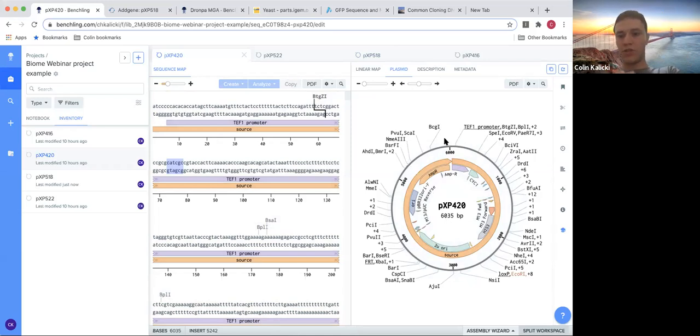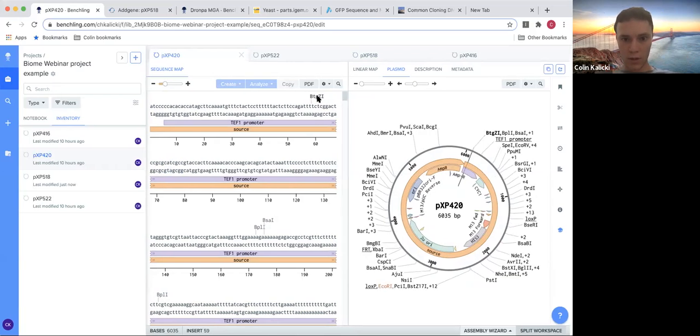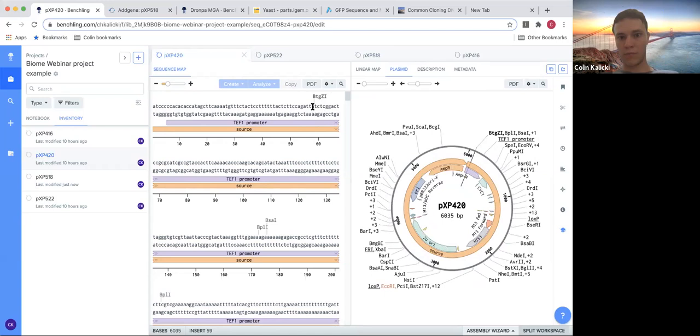So you're going to have these restriction enzymes. And if we zoom in really closely, or let's say let's tag one here. You see here, this already marks a restriction enzyme. They're just some sort of nucleic acid sequence, only about 4 to 8 nucleic acids in length or so, which are going to cut. This one is a sticky end. You can see how it cuts. It cuts kind of weirdly, where it's going to leave things hanging off. It's going to look like that and that. They call it sticky ends because these are sticky. They're going to bind to things. And this is how you would bind something to it, insert something in there. And you would add the ends to attach it correctly. That's how you're going to insert into the plasmid.